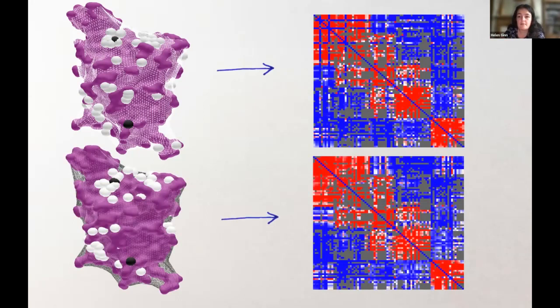And the hints are that you get these dropout values, like these 3 antibodies in the top group here, which means that this model is actually not that great. And the model below is actually closer to the real solution. And the reason this happens is because we're looking at a competition matrix, which is based on a distance matrix. Yeah, just highlighting those antibodies there.